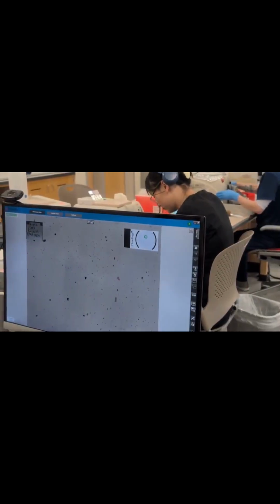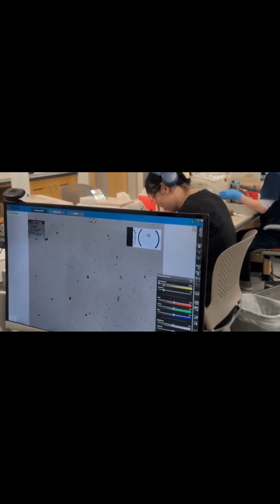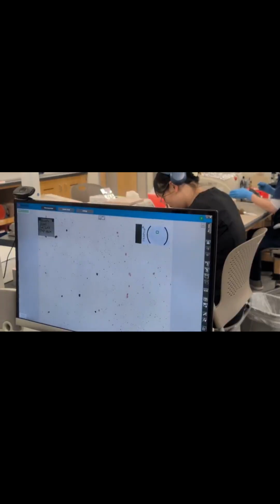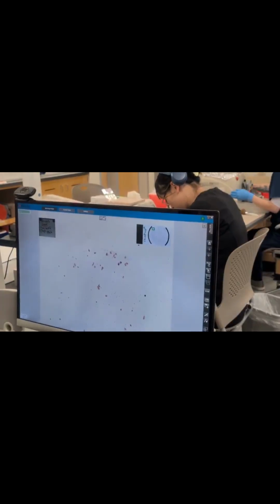Before you could do the illumination, you do have to increase your mag to at least 2.5. Okay. And if I wanted to go to a certain region on the slide from here, you can also click up here too. Like I could be like, okay, let's start right here, and it'll take me there too.